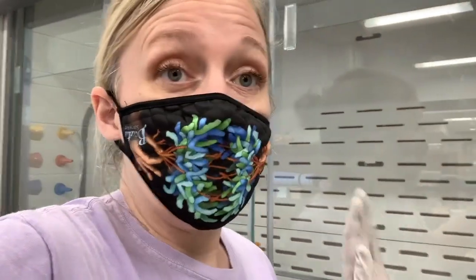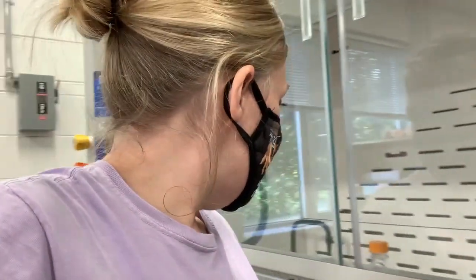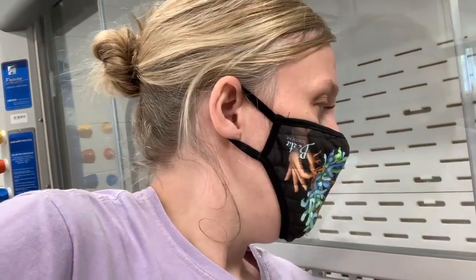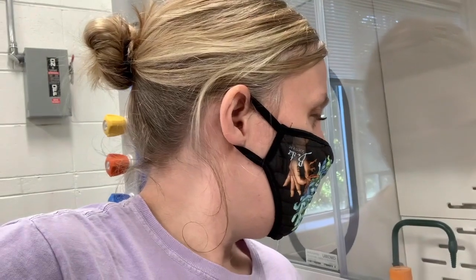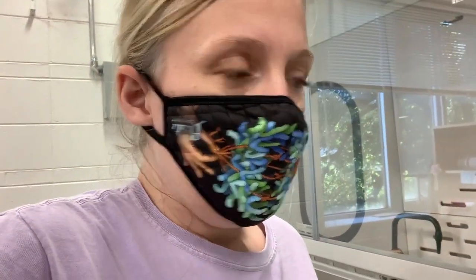And then you want to also make sure that you leave the light off in the chemical hood because the Dep C can be a little bit light sensitive. So as the Dep C incubates, it will degrade to ethanol. Might take you a minute to get everything stirring without making a lot of noise.